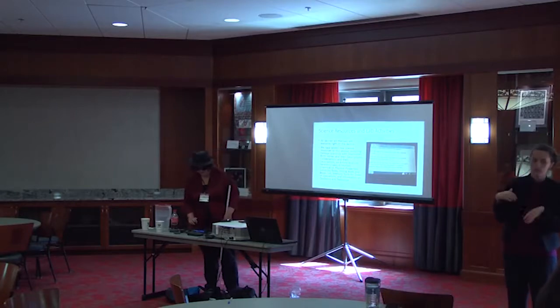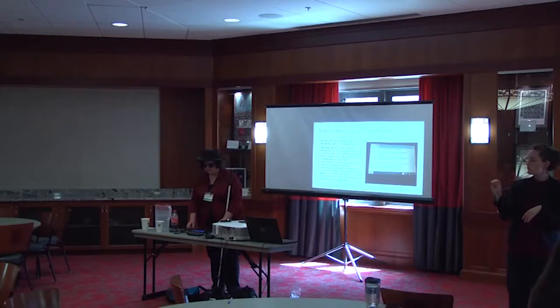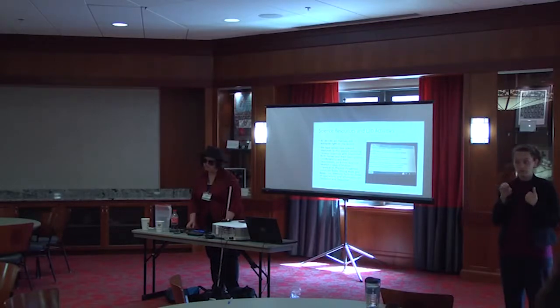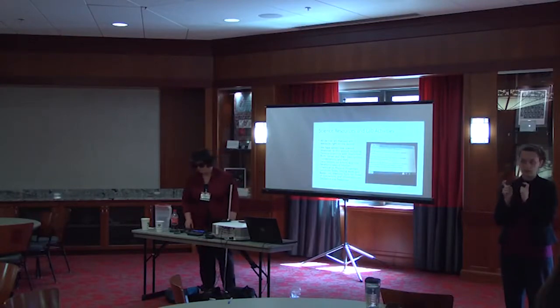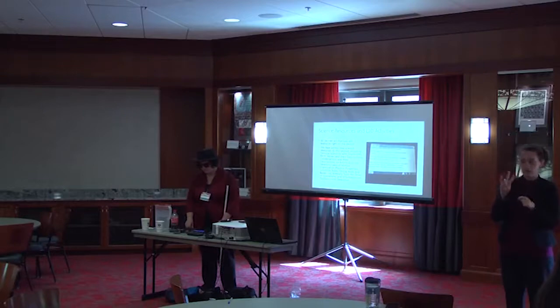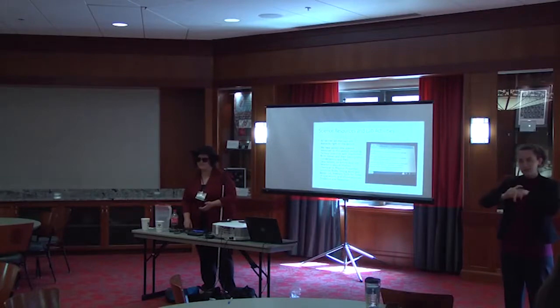Changing the language to Spanish requires restart. LabQuest, do you want to proceed? And I call this my dummy feature because it will check, did you really want to turn that? Because when it changes the language, you really need to know the language or be familiar with the screens, or you're going to be stuck in a different mode. So, push button, yes. In this case, we do want to change it.